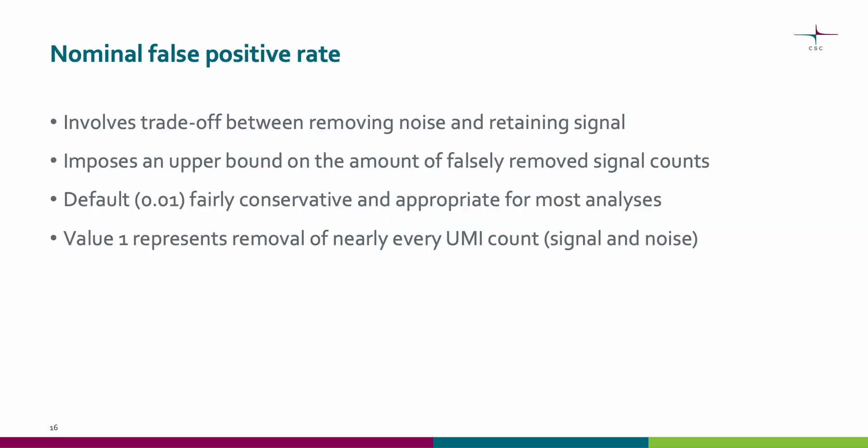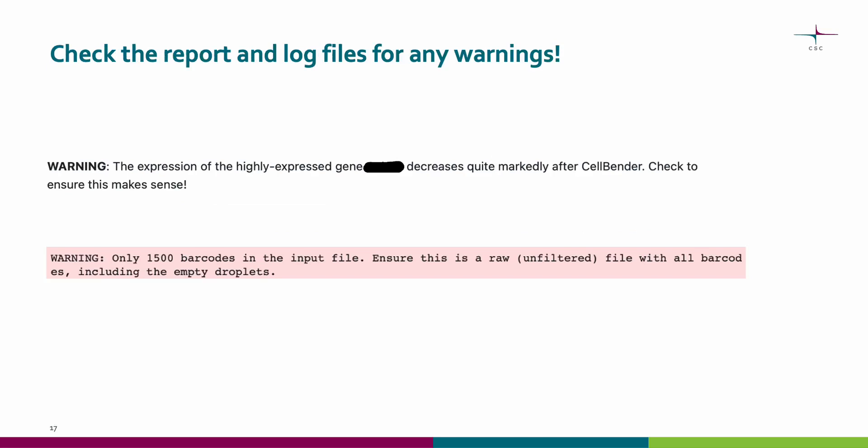Finally, we will take a look at the last parameter called nominal false positive rate. Any noise removal algorithm involves a tradeoff between removing noise and retaining signal. The nominal false positive rate imposes an upper bound on the amount of falsely removed signal counts. The default value is fairly conservative and appropriate for most analyses, but you can modify this based on your dataset. A value of one represents removal of nearly every UMI count, meaning that almost all signal and noise are removed. Please remember to check for any warnings in the report or log files. For example, the report file issues warnings if it seems that you have not used the raw feature barcode matrix as input.